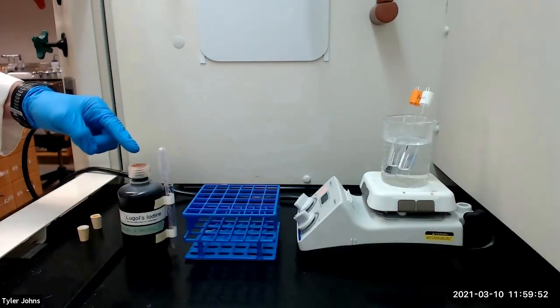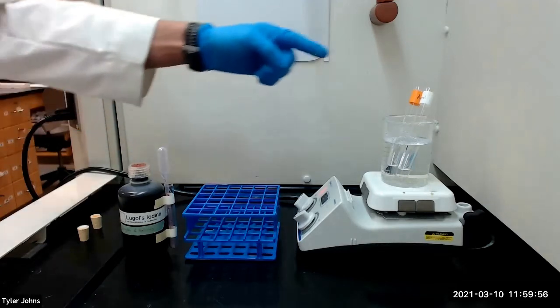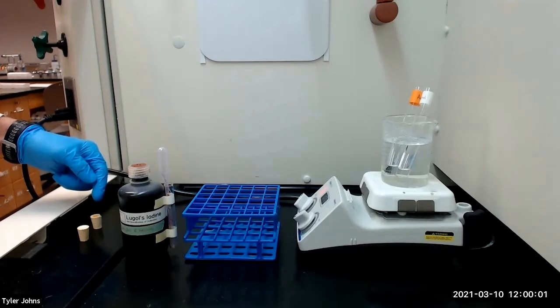We will next add 4 milliliters of Lugol's iodine solution in 1 milliliter portions to the test tubes, making sure to cork and shake the tubes after each addition of iodine.